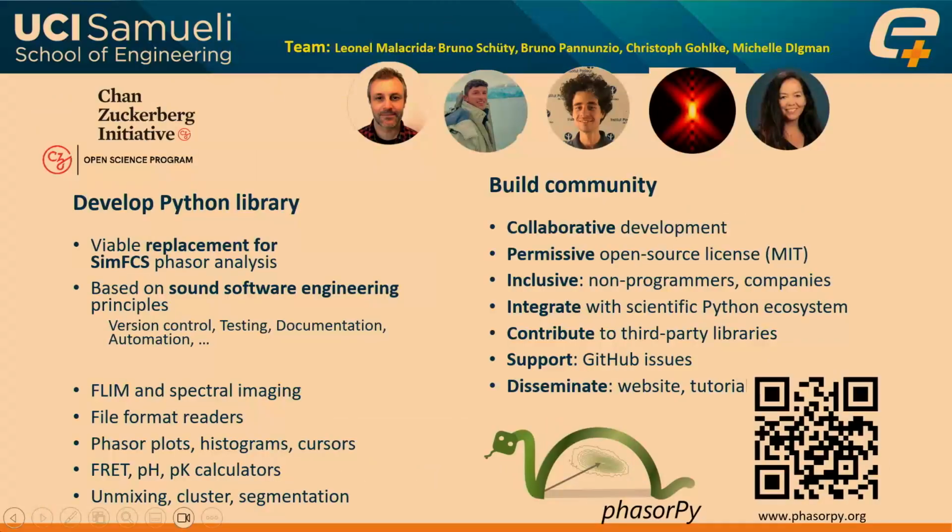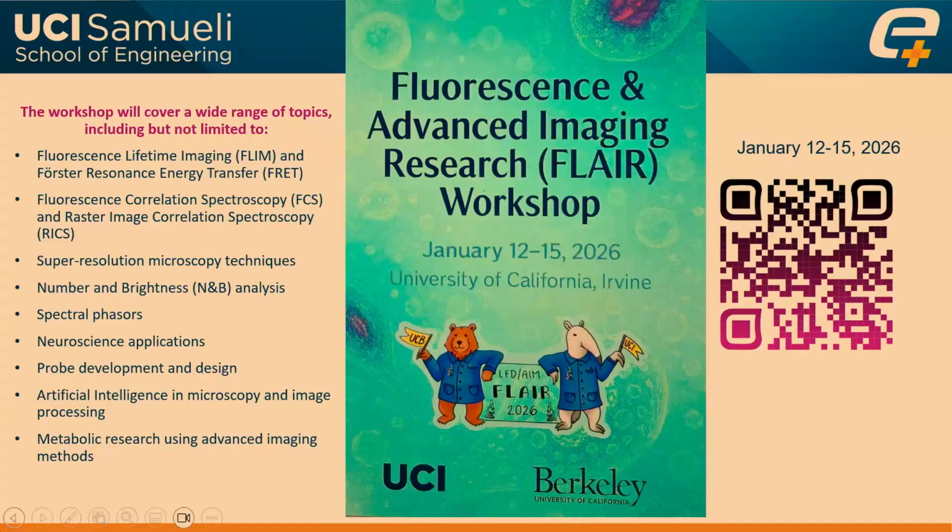But I also wanted to share that if you're interested in looking at the phasors, we do have, we developed a Python library with Lionel Malacrida. So you can actually go to the phasor py analysis.